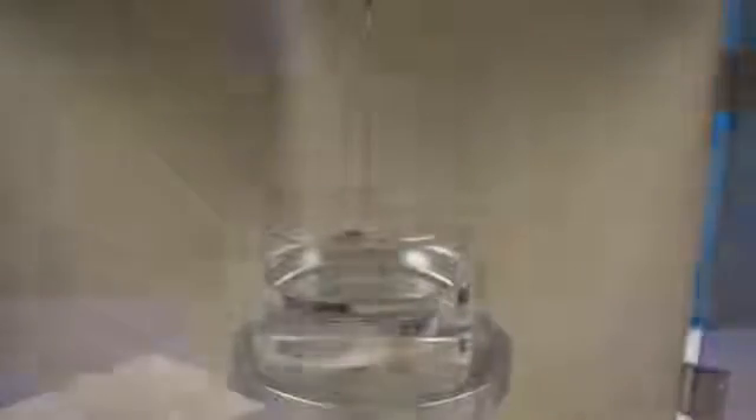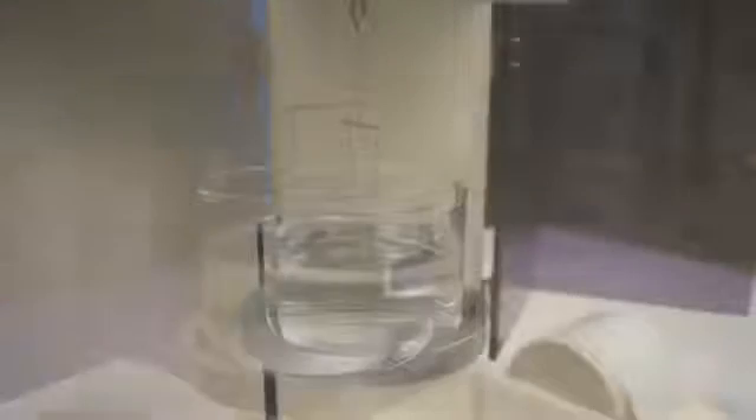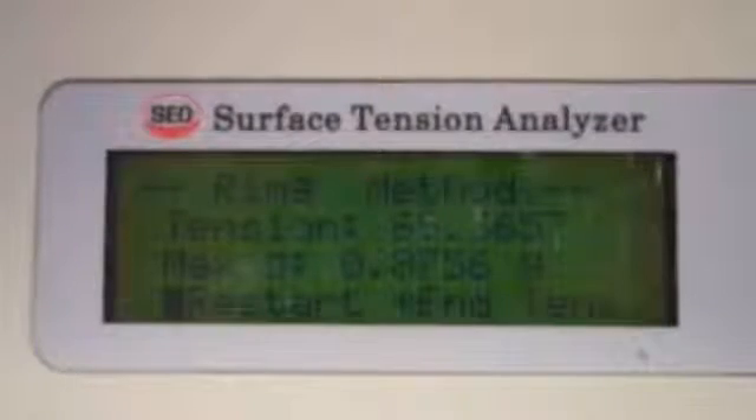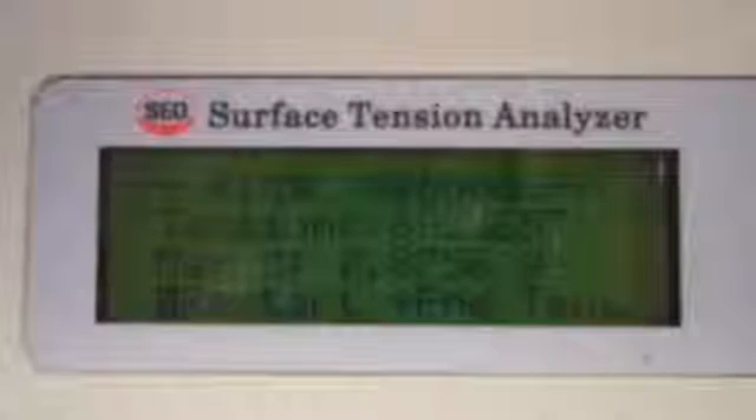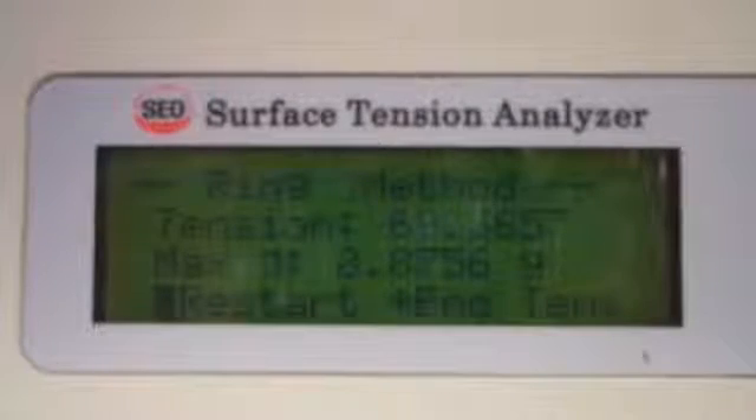Continual calculations of the tension are viewable in the digital readout as the ring progresses upward. Once the ring pops from the liquid surface, a final surface tension in dynes per centimeter is displayed and ready for printout.